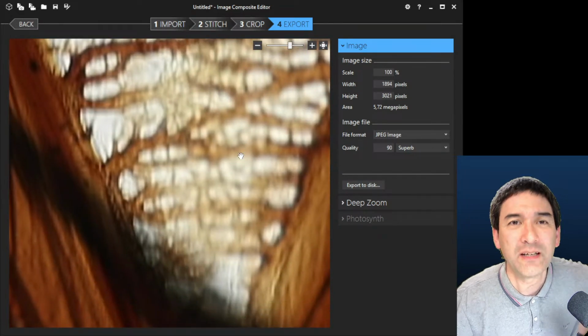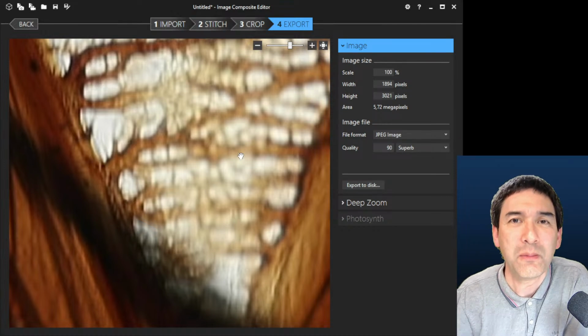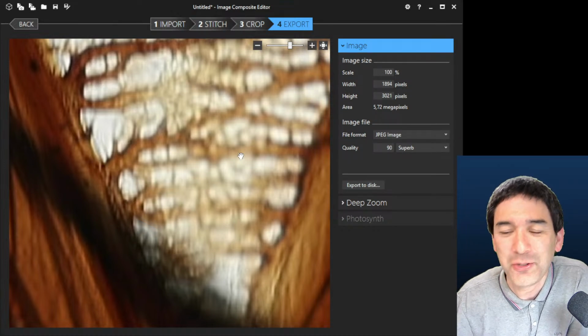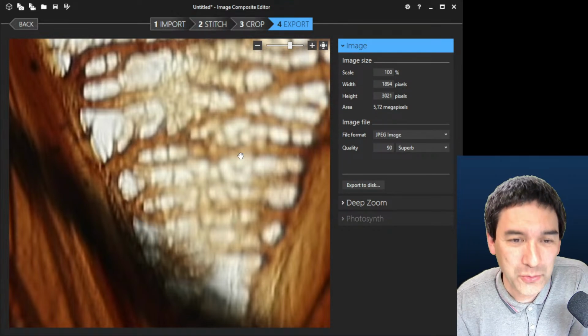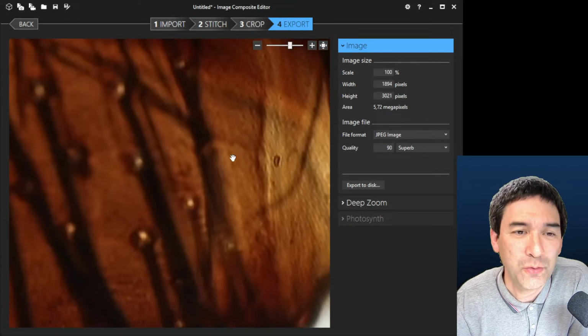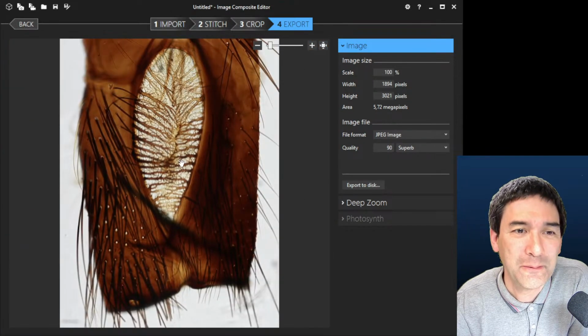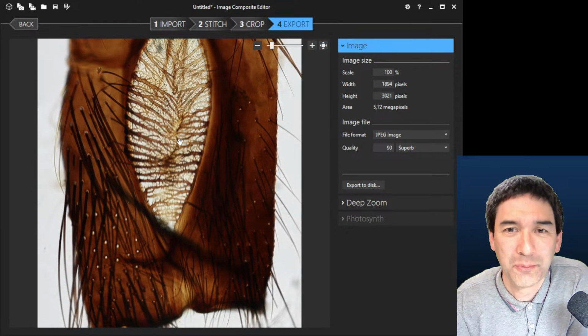So this also explains a little bit, back to the question, whether you get a higher image quality if you're using static images, and the answer is most likely yes, because if you go too fast and make the video too fast and the shutter speed is too slow, then you're getting something like this.